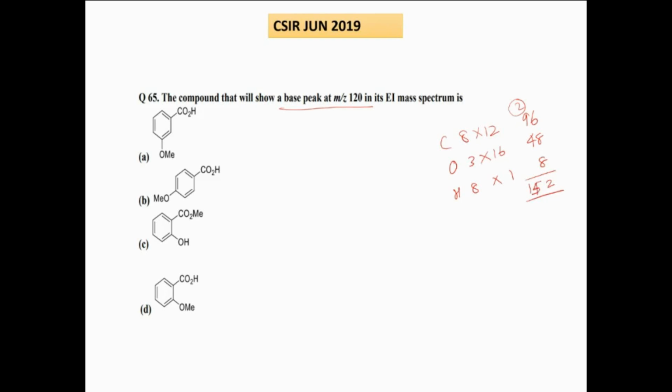152 வராதா? Yes. எல்லாம் தூங்குறீங்களா, முடிச்சிருக்கீங்களா? I have a doubt, I have a serious doubt. ஏன்னா எனக்கு பாசிபிலிட்டி பார்த்தா 152ல 142ல வராது, அதனால தான் பார்த்தேன் நான். ஓகே, now they say 152 and they say they have a base peak at 120. So 152 minus 120 பண்ணி பார்க்கணும்.